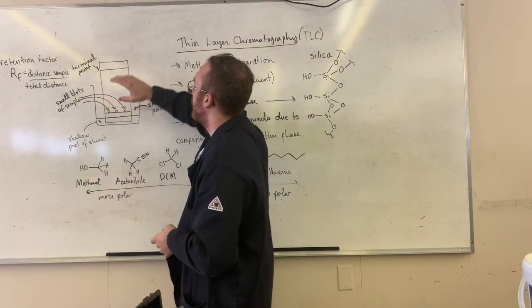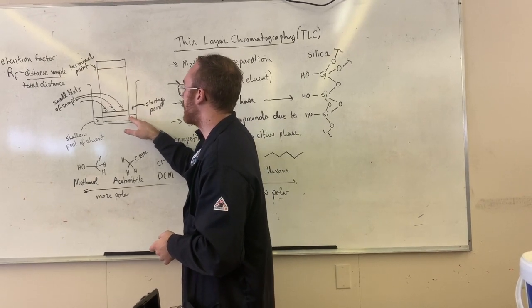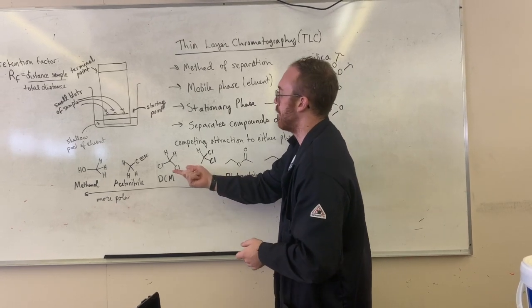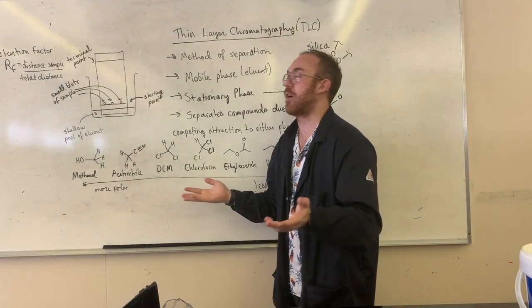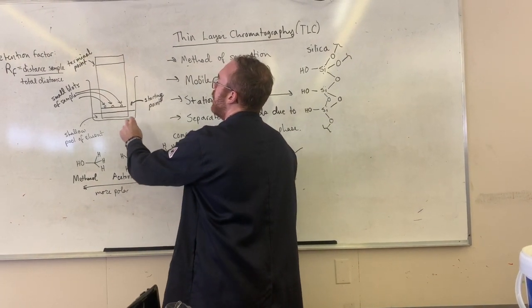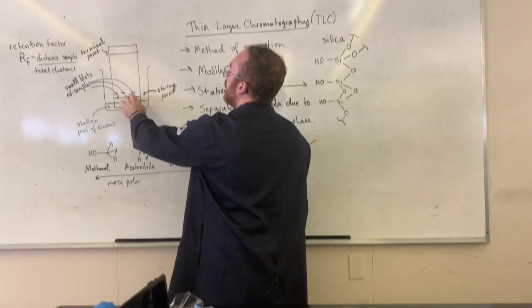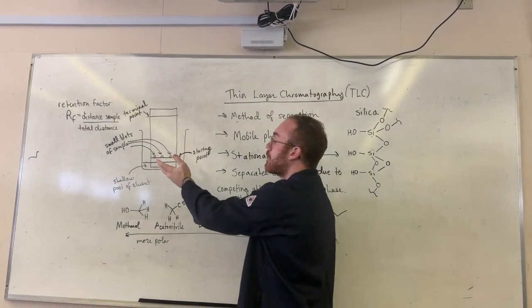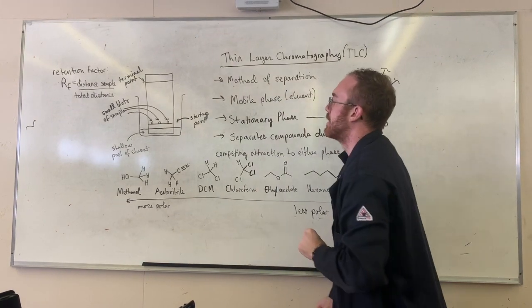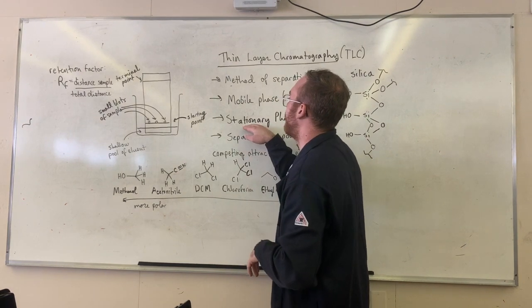So a TLC plate is going to sit in a pool of solvent. This solvent is going to be this mixture of, let's say, ethyl acetate and hexane, but it could be any of these other solvents depending on how polar your compounds are. And when you think about the way that those solvents are interacting with your compound, the more polar your compound is, the more likely it's going to be less attracted to a nonpolar solvent. And conversely, more attracted to the alumina base, or in this case, we're using silica. So that's going to be considered the stationary phase.